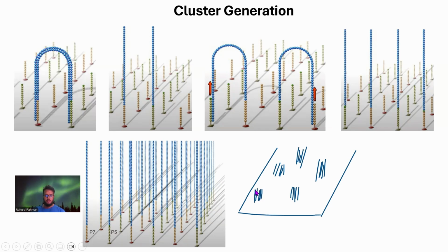Now understand that we are going to try and read the strand from here. This will be one strand of one fragment. We are again going to try to read this one strand from here, one strand from here.